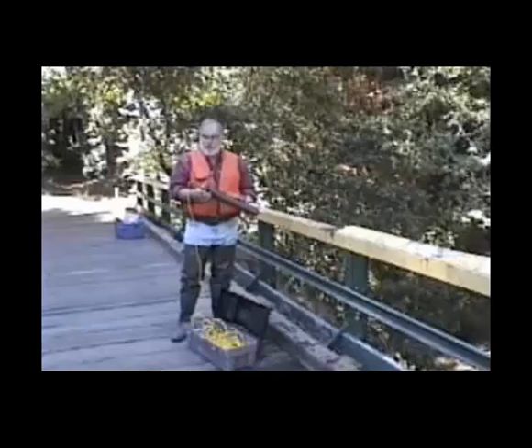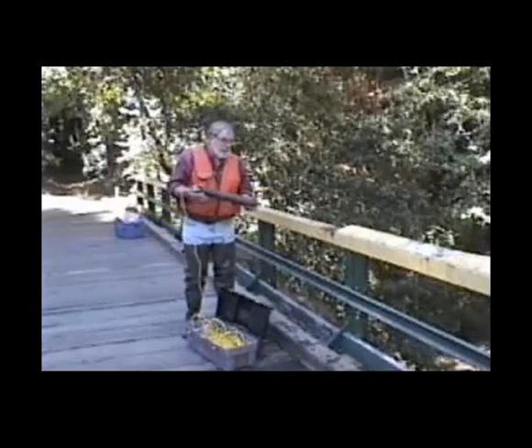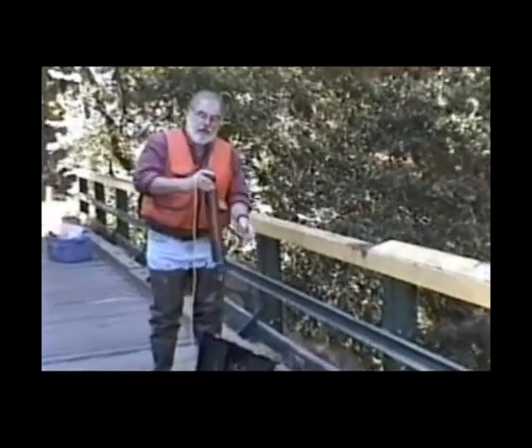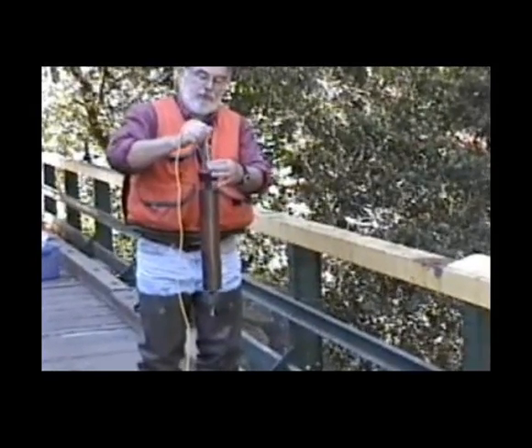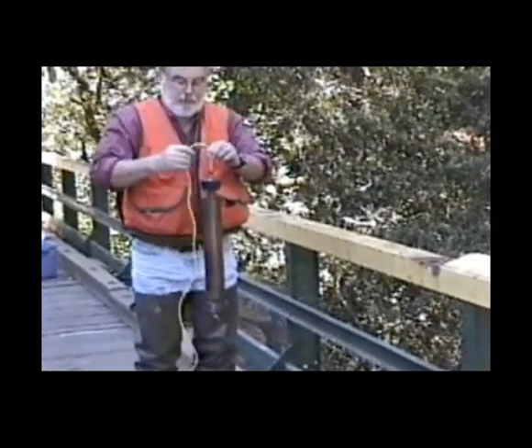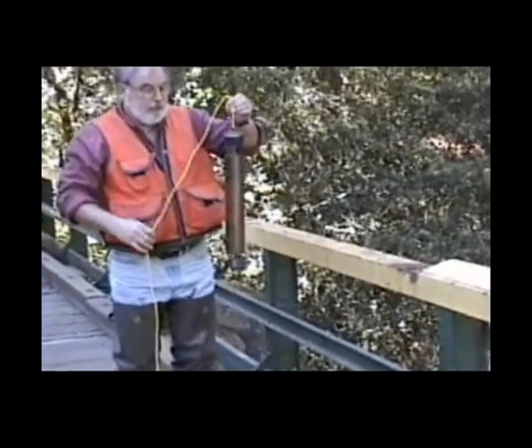Okay, I'm now going to demonstrate how to cock the sampler and get it ready for sampling. You simply remove the 2 end caps, pull it tightly, and the cocking mechanism locks onto the brass washer on top of the central tube and holds the end caps open. Now obviously the sampler should be properly cleaned and rinsed prior to use, and the assumption is that this particular one is.